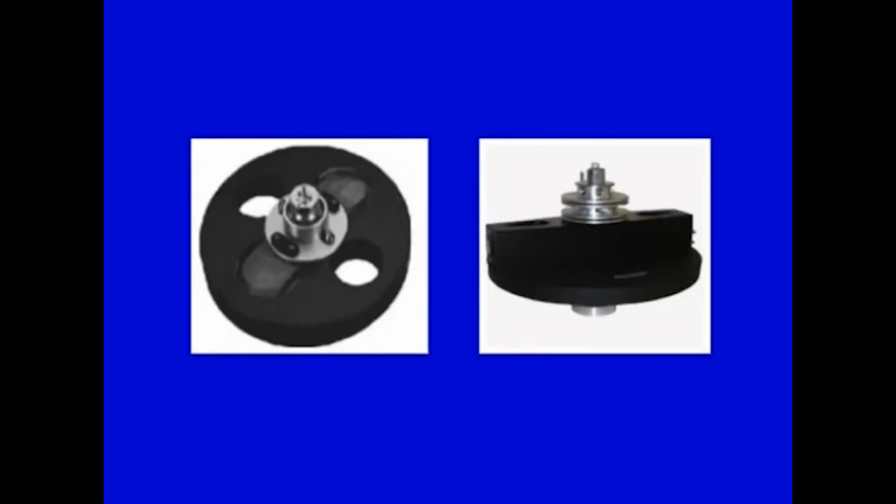Now, continuous flow rotors. Continuous flow rotors are used for separation of different types of monocytes or lymphocytes from human blood, to purify Kupffer and endothelial cells from sinusoidal liver cells, and fat storing cells from rat liver, fractionation of yeast cell population, and many other applications. In real life it looks something like this. There is a big rotor, and on one side there will be an elutriator rotor like we have described.